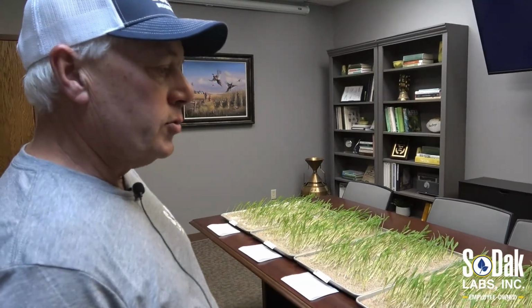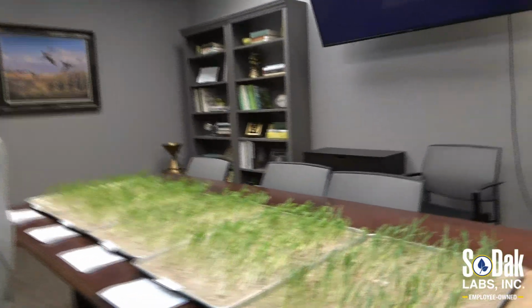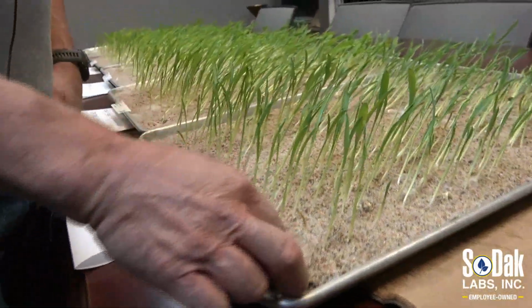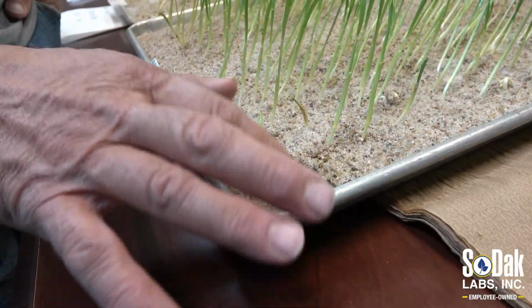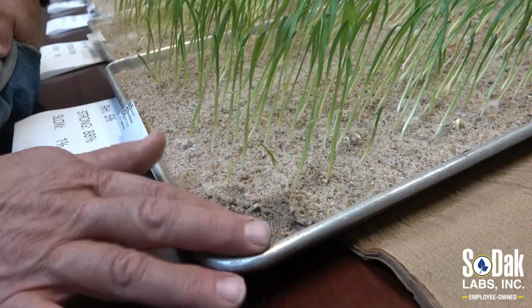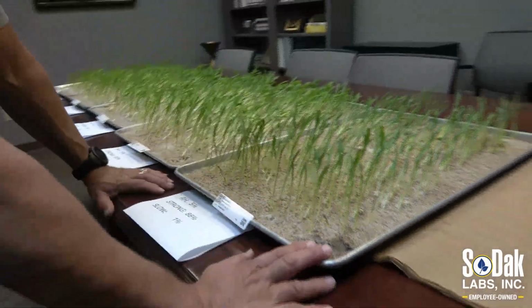And at SoDak Lab here, we like using the sand test for sweet corn. In the AOSA rules, it defines different methods. We use what's called the TCS method, the top of crepe cellulose paper. So the crepe cellulose paper is put on the tray and a standard amount of water is used.